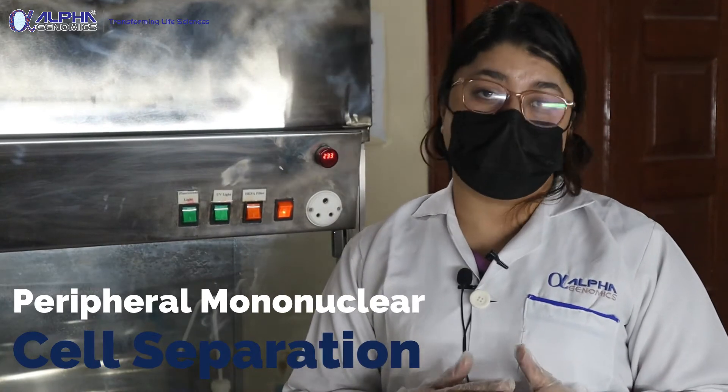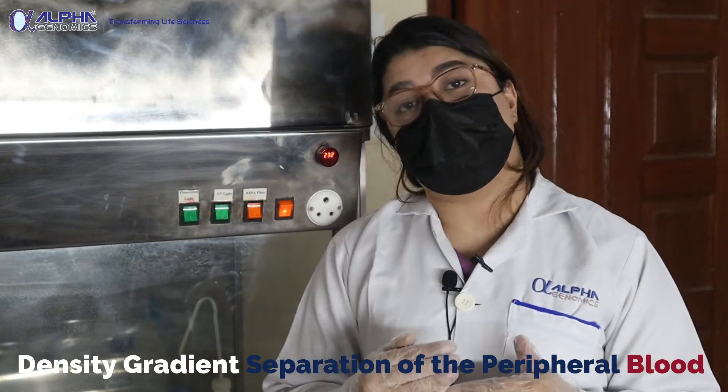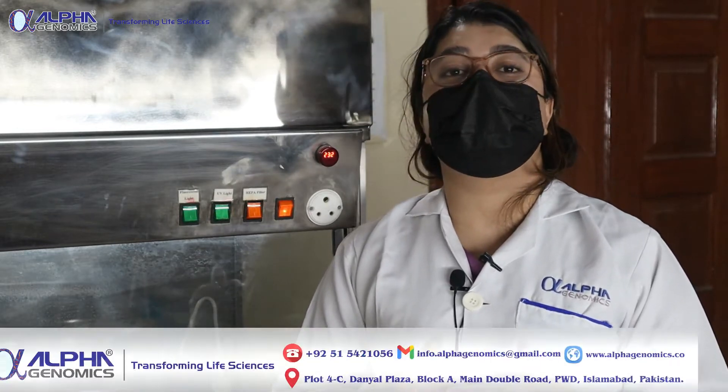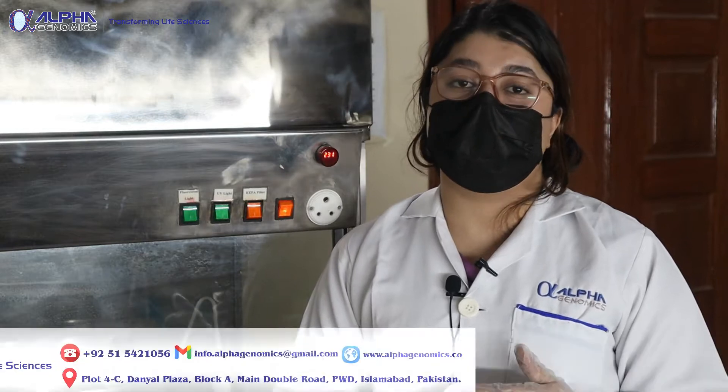The current experiment we are going to perform is about the density gradient separation of peripheral blood into different populations. The main target of this experiment is to obtain the mononuclear cell interface, which will be used for further procedures — we are going to perform a cytotoxic assay.